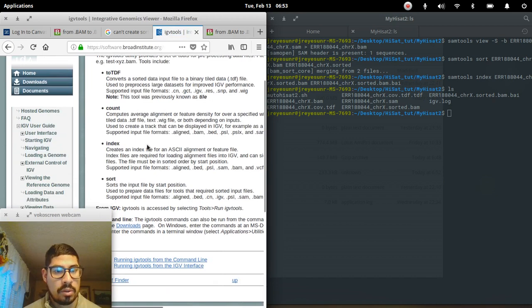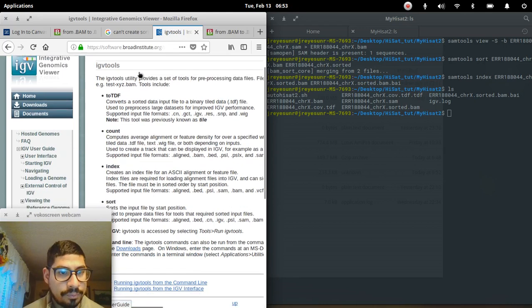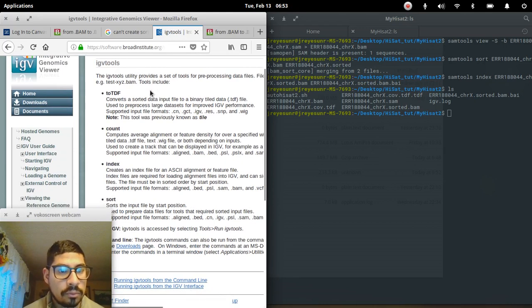So here it gives you an order of how things workflow. Well, that's all right.